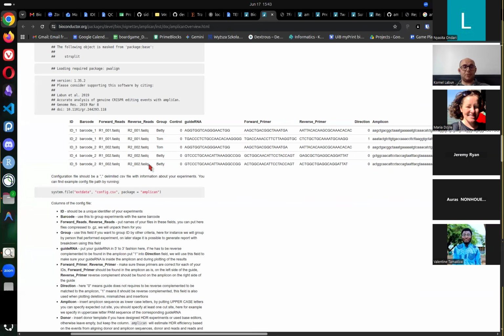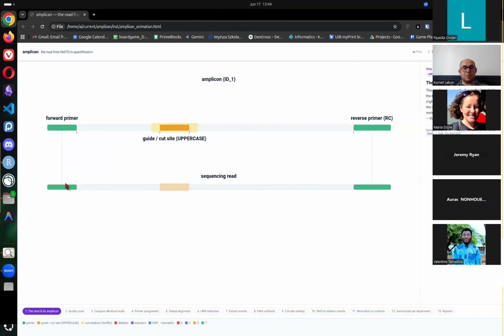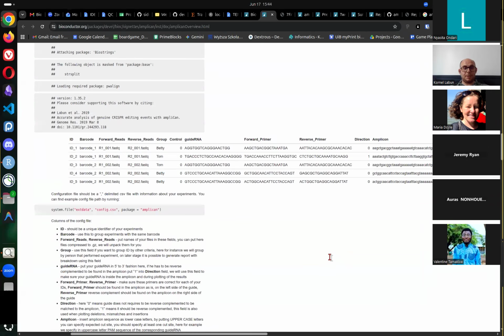And then we have two different barcodes, so to say, which have unique primers inside each barcode. You need to have a unique combination of forward and reverse primers, because this is what is being used to recognize and split reads into samples. So here my read comes in, and I match using ampliCan towards this read: does it contain the forward primer? Does it contain the reverse primer? And then it checks the option. There is an option for that in ampliCan. Let's see, it's over here.